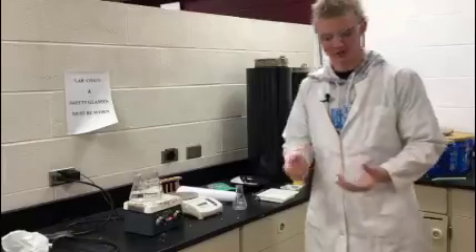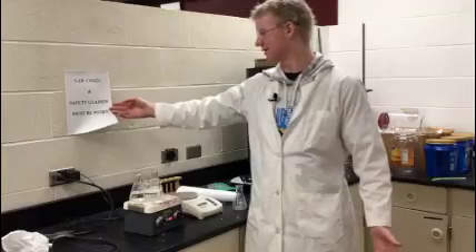Now we're going to go over safety. What you have to wear is a lab coat, glasses, clothes, and sturdy shoes. As you can see, it says lab coat and safety glasses must be worn in this area.